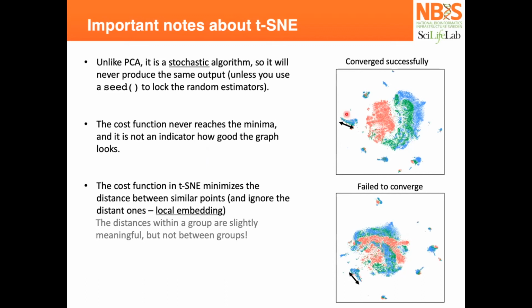It could be the differentiation path or some specialization process of those cells, and it's visible in both embeddings. However, the distance between this cluster and this one is quite different in the 2 embeddings. That distance is meaningless. It doesn't mean that those cells are more similar to each other than these ones. It has no meaningful information.